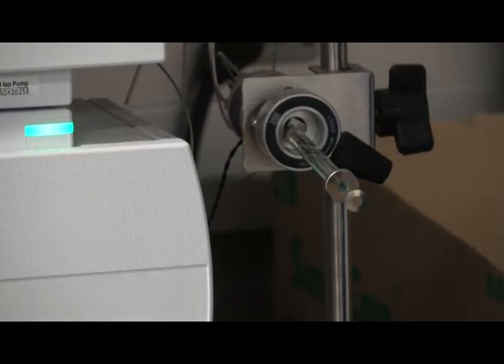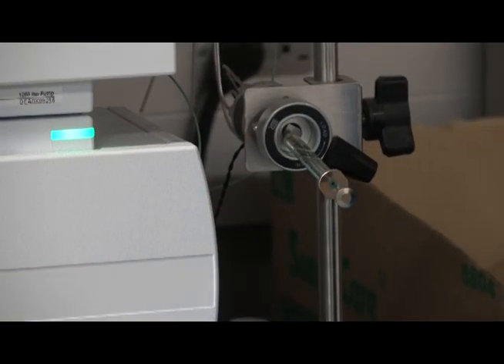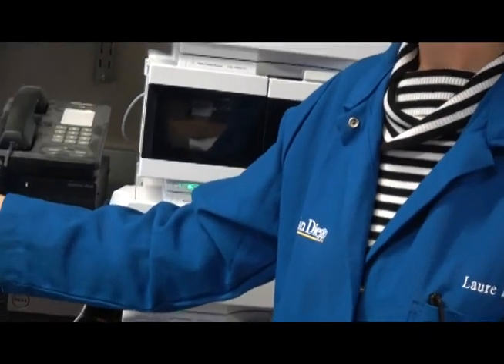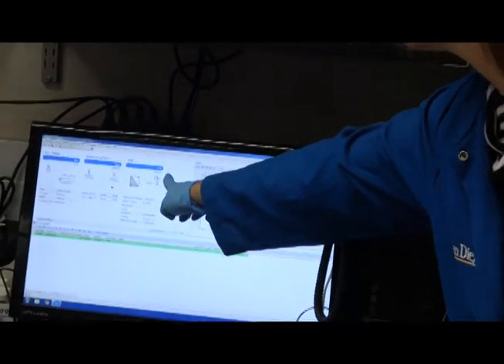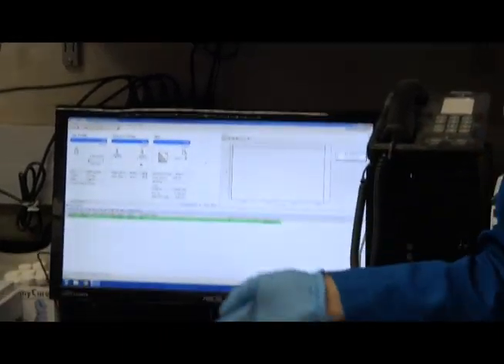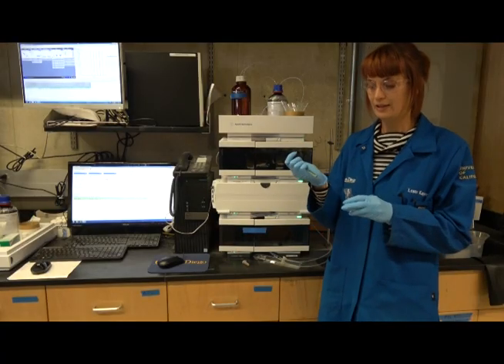and you see that all those green buttons turn on and on the GPC itself it's showing blue and it says run and you have a green line meaning that the experiment started.